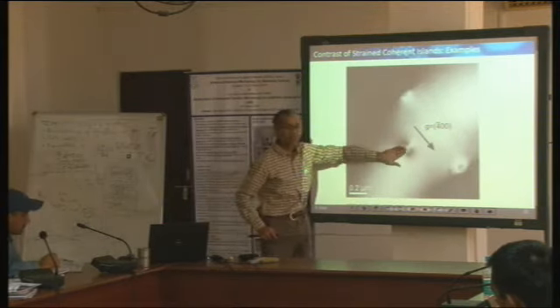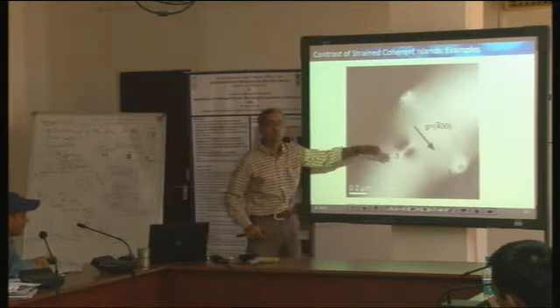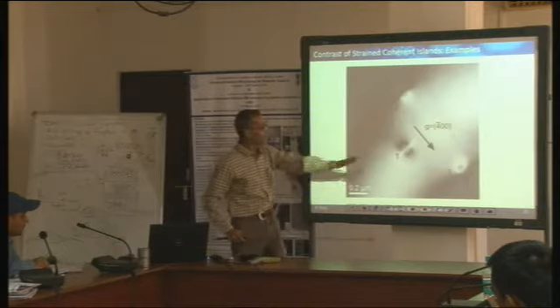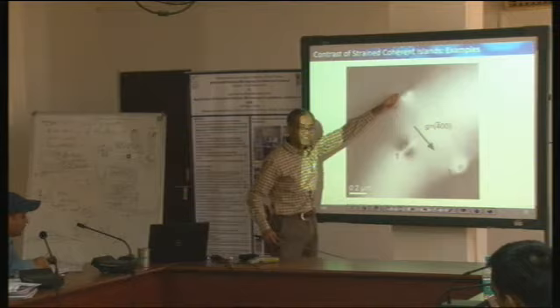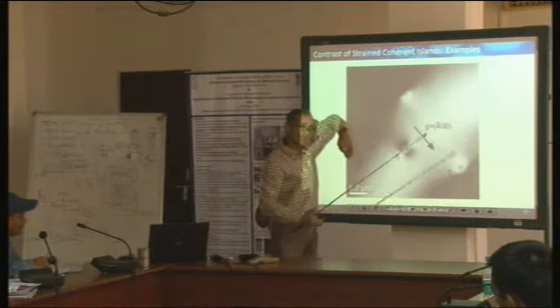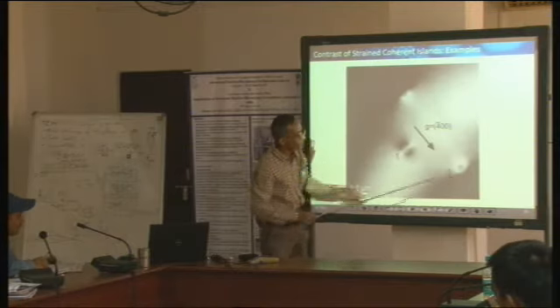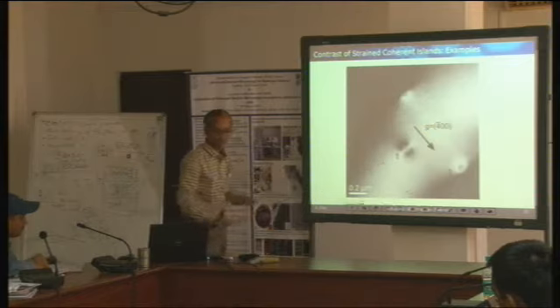At this particular place, this area is so oriented that it is turning out to be a symmetrical illumination. In this case it is asymmetric, in this case also it is asymmetric, which means that this sample is somewhere bent like this. Here it is symmetric, and you see here we have symmetrical contrast, here we have asymmetric contrast.